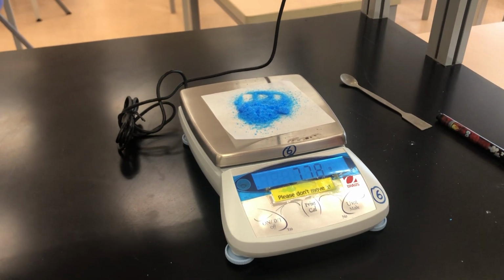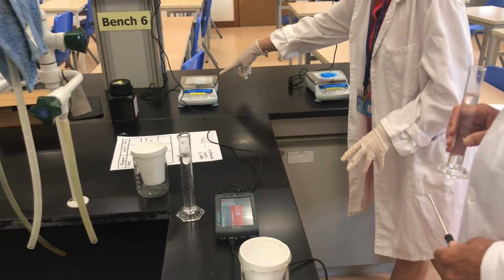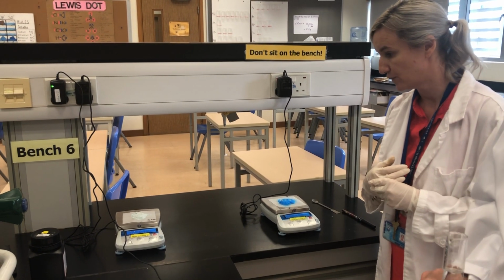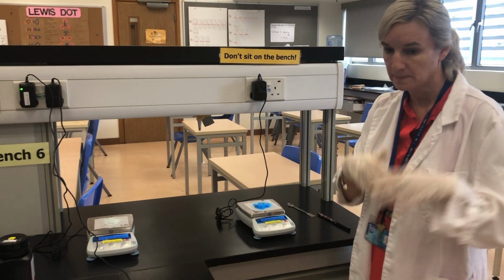Now you can see I haven't been a particularly good scientist because I've been in a hurry and there's a little bit of error on the side. You can see I've got a little bit of solute. We shouldn't aim to do that in class. We should always be really precise when we weigh it because we want to minimize our errors. Now, Mr.